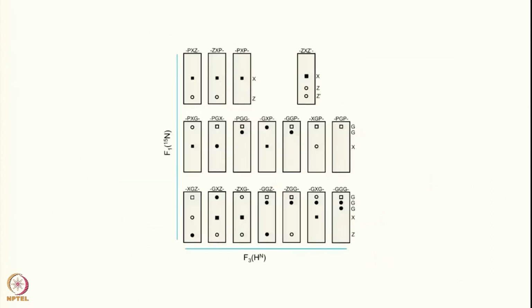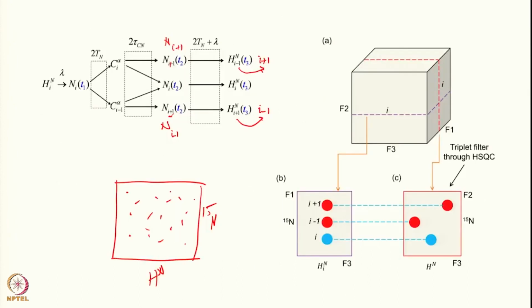Okay. And another important thing you have to notice is that I have used different colors here. See, I have used one particular color for the self peaks, the peaks of the same residue, and one particular color for the 2 others because they have a negative sign. If this is positive, this is negative, and vice versa, whichever one you want to choose. So they have opposite signs, and that also shows up here, and this is extremely useful in a generalized sense.